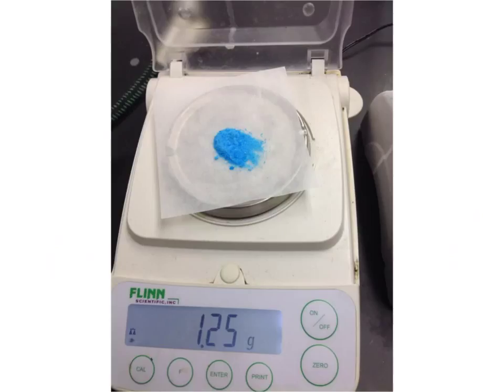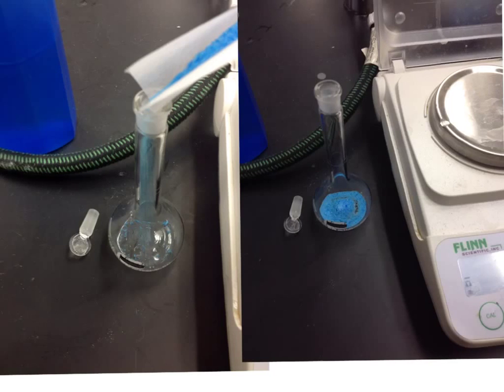So after calculating how much I need, I'm going to use my spatula and measure out 1.25 grams of copper 2 sulfate. And hopefully it's pretty close. It shouldn't be off by more than 0.01 if you're off at all. And you're going to be using weighing paper to get the mass of your solute. So when you put the weighing paper on the balance, make sure you don't forget to zero that out before you get the mass. The weighing paper is pretty flexible, so in the next step you can go ahead and just pick that up and fold it in half and let the crystals fall down into the volumetric flask.